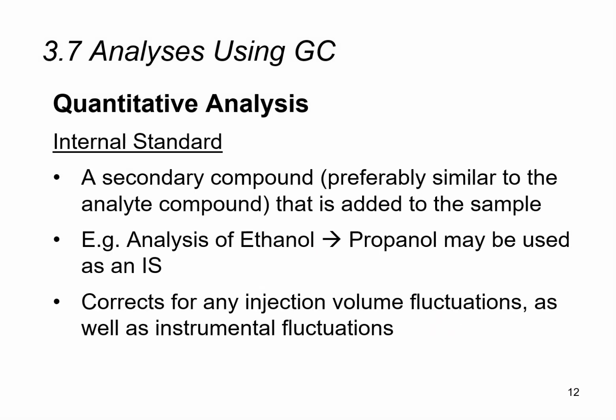So the method of internal standards is particularly applicable to gas chromatography, right? And I've described that we use a secondary compound that is deliberately added to the sample so as to correct for injection volume fluctuations.